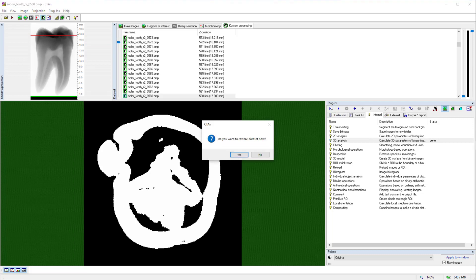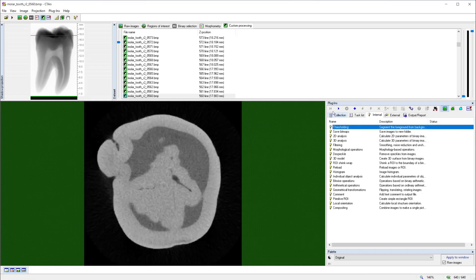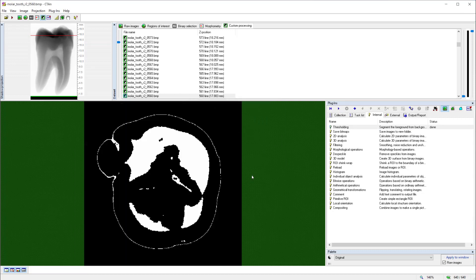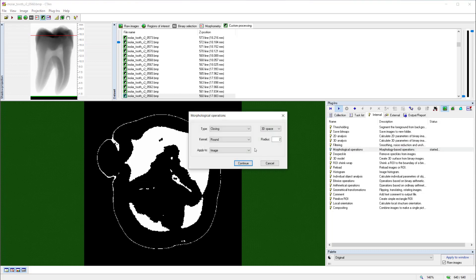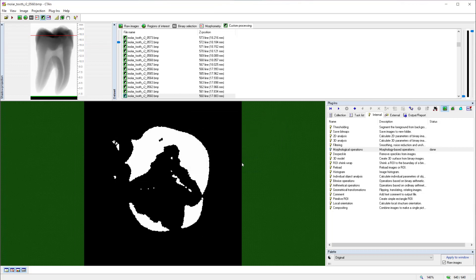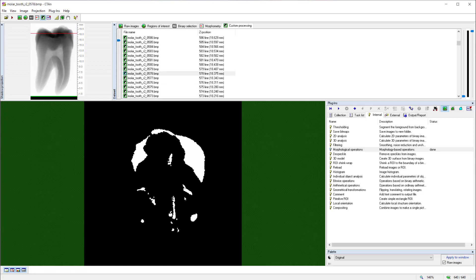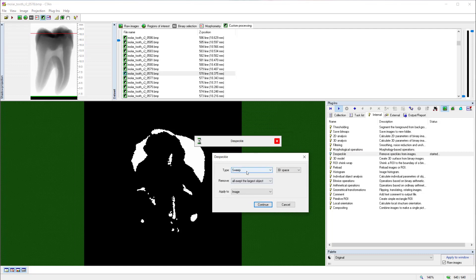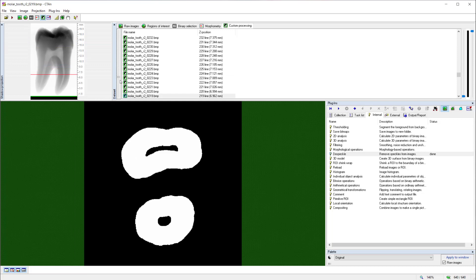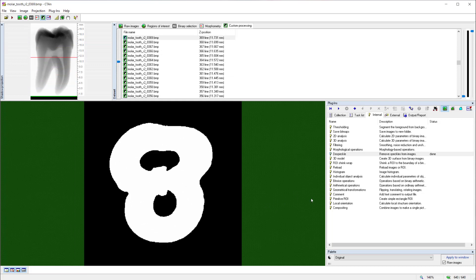If we click the first button under the plugin's heading and reload the dataset and reapply our modified threshold of 65 to 124, that peripheral artifact is again visible. But if I run morphological operations, and choose the operation opening, and run it just with a single pixel radius only, then that artificial line largely disappears. Furthermore, there are some small pixels on the surface, which are also artifacts of partial volume effect, but can also be removed by performing once again the sweep operation to remove everything except the largest connected object from the image. And now, we are left with a clean binarization of just the dentin of the tooth.